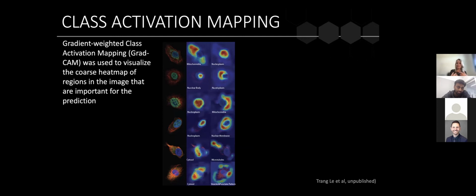So by now, we're very confident that these models are looking at biologically relevant features and that we can use them to really start to dissect the spatiotemporal variability of the human proteome across cells of different shapes and forms and other things. So this opens up a lot of, I would say, single cell modeling of proteome shape.